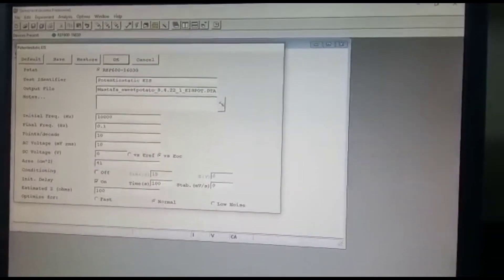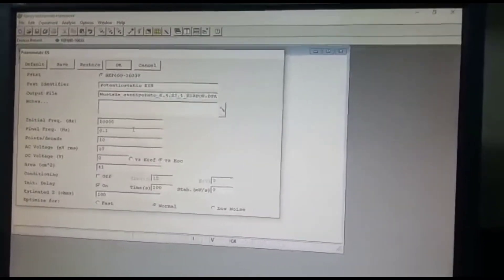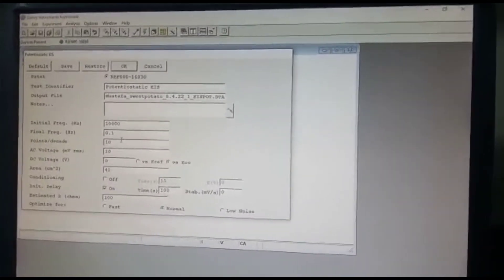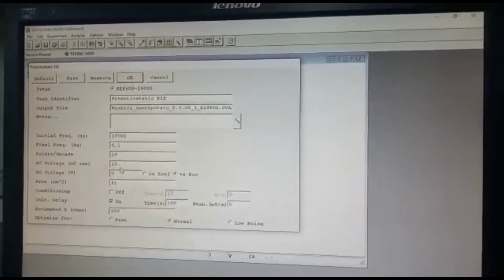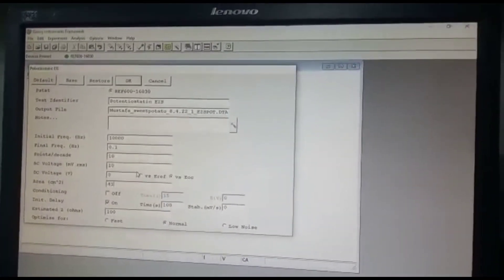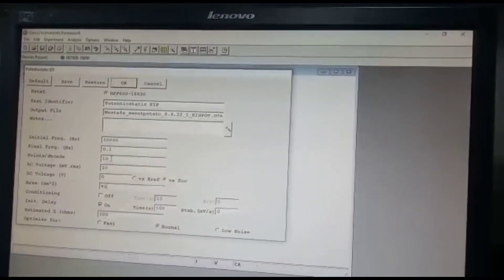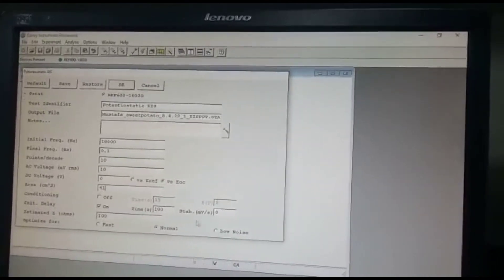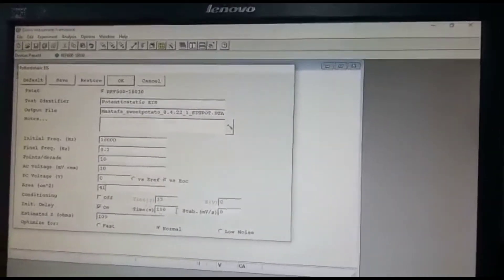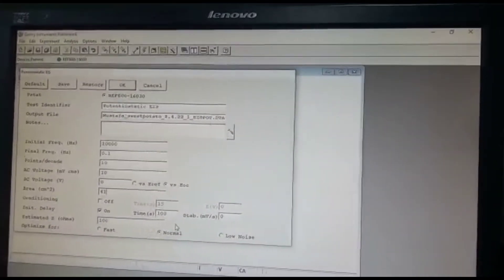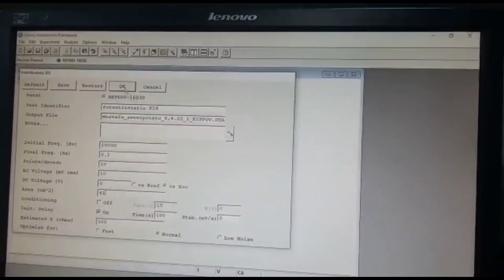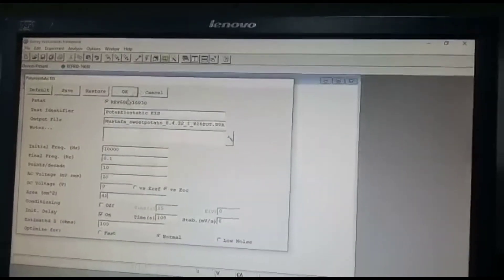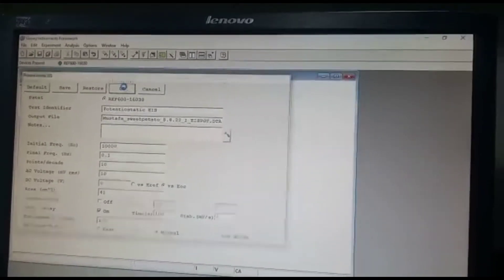Alright, so the rest you just set it constant. I mean, like AC voltage is 10 and DC voltage is zero, decades is 10, and we have an initial delay, open circuit delay of 100 seconds. So after everything is okay, we just click OK.